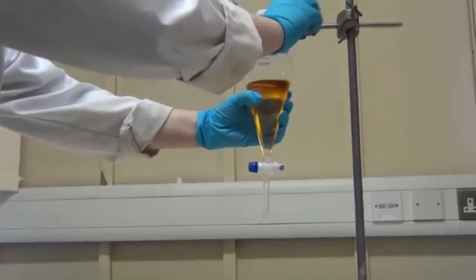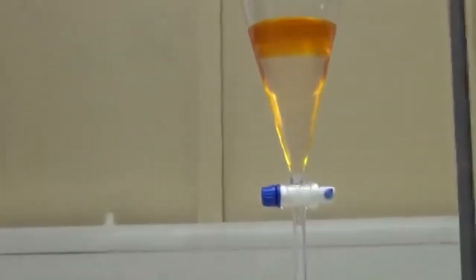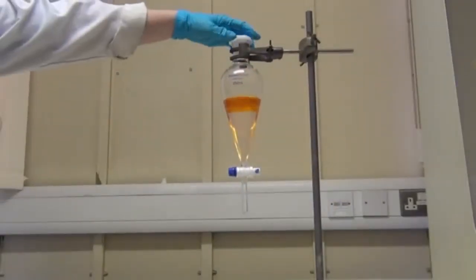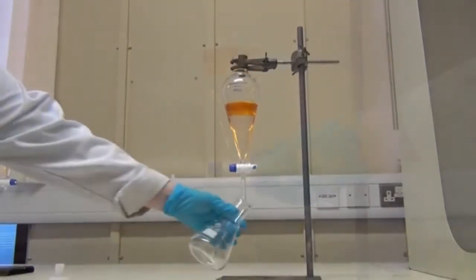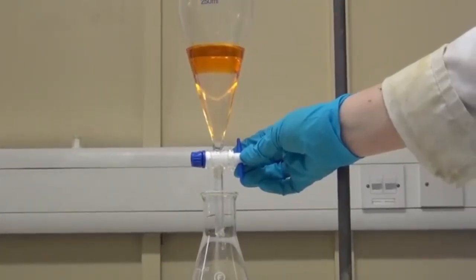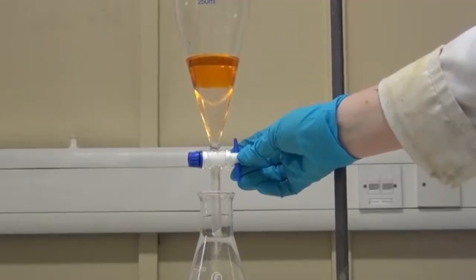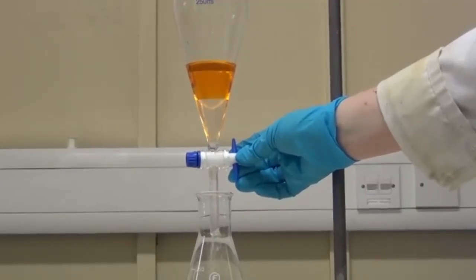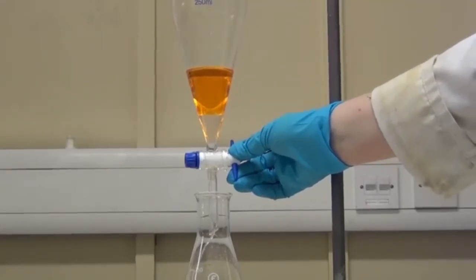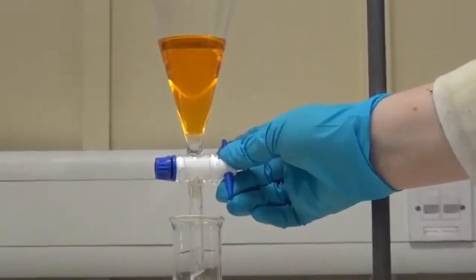This separation shows that the dye that we added has gone into the organic phase, which is why the bottom aqueous phase has lost its colour. Now it is time to extract the layers. Always start by removing the stopper from the top of the funnel. Open the tap and drain the first layer into a clean conical flask. Make sure you start to close the tap as the bottom layer drains out to slow the rate of flow and to help you correctly close the tap when you can no longer see the separation between the two layers.